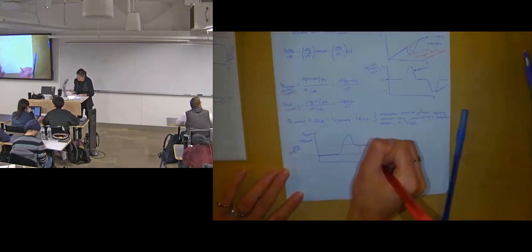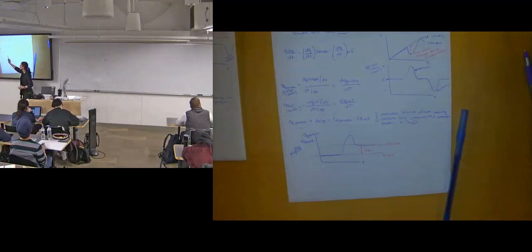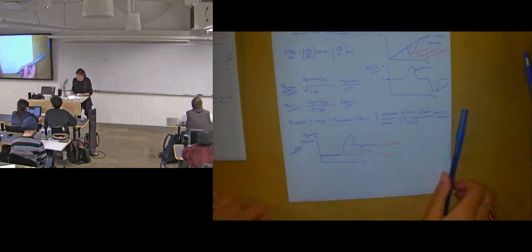There's some difference in heat capacity between the folded and unfolded state. Okay. It's not the same as this change in CP. We're also going to define another change in CP between a baseline curve and this peak. There's a lot of delta CPs going on, so try to keep track of them as we go, okay? It can be a little bit confusing.